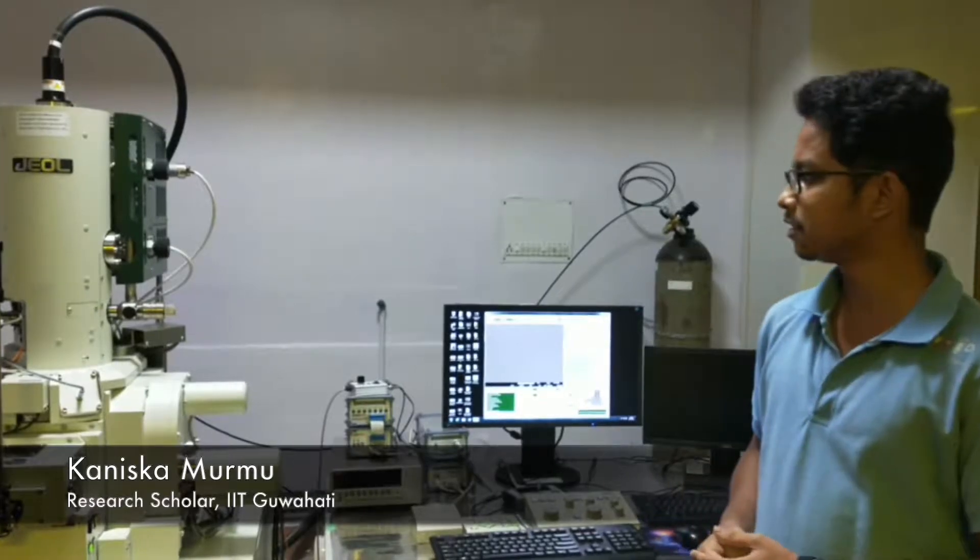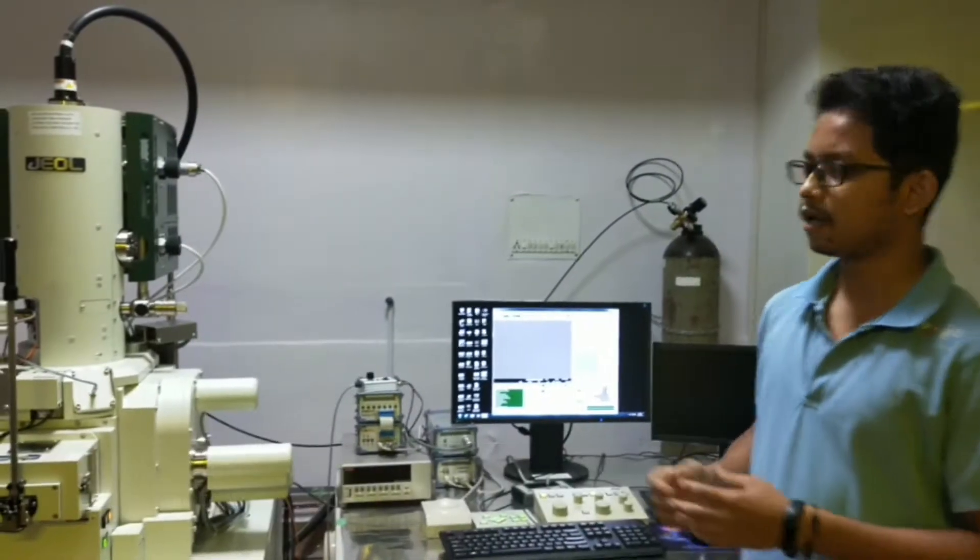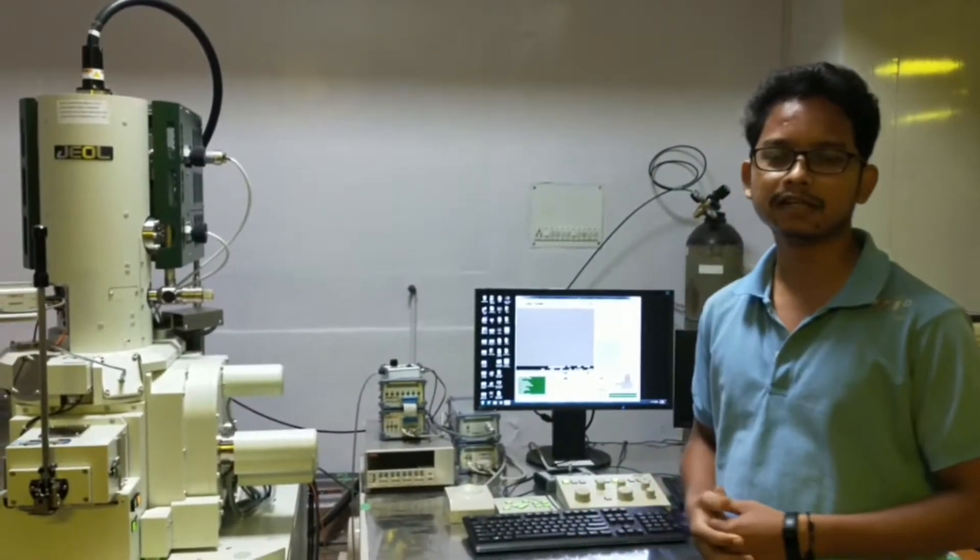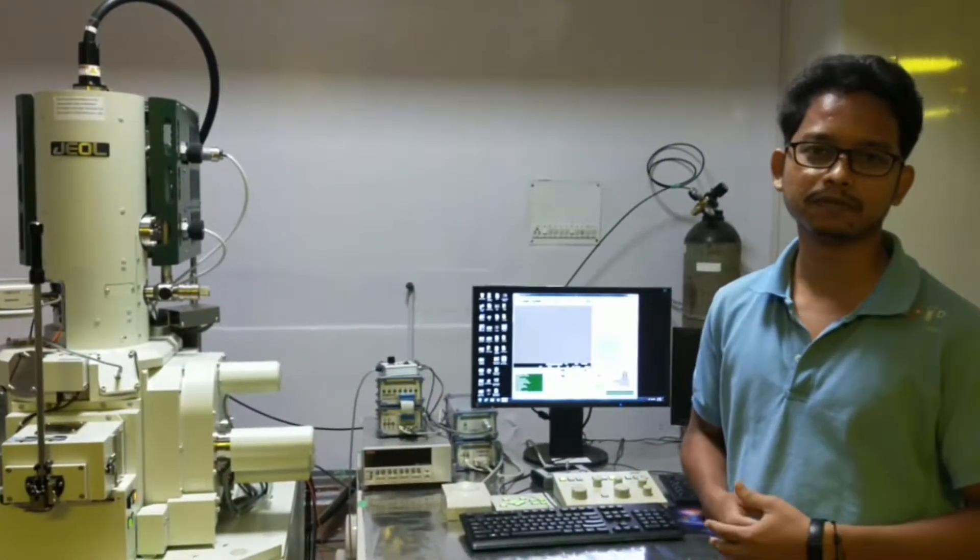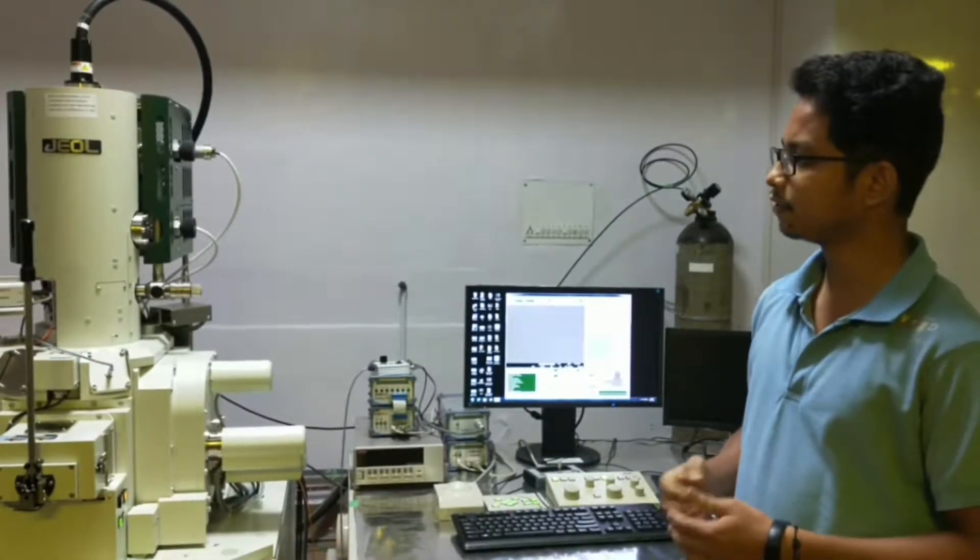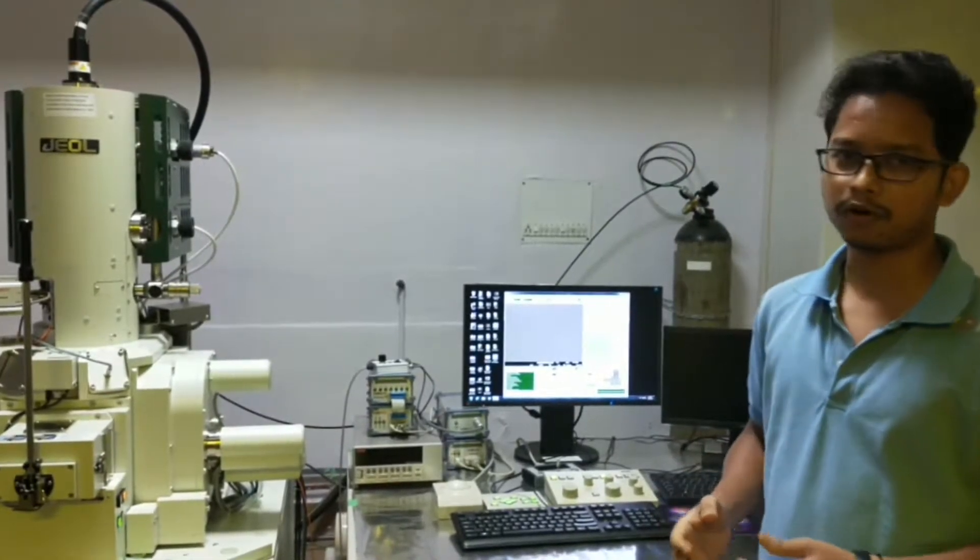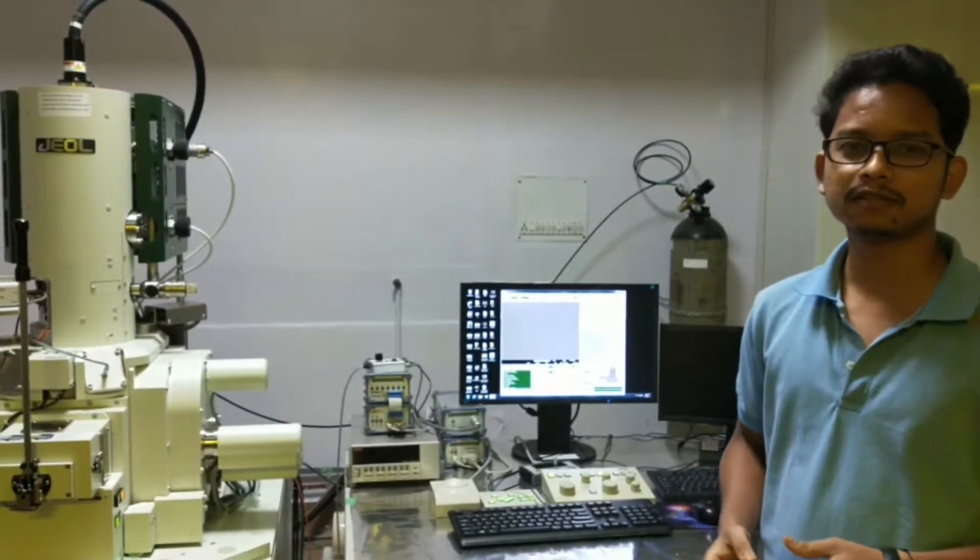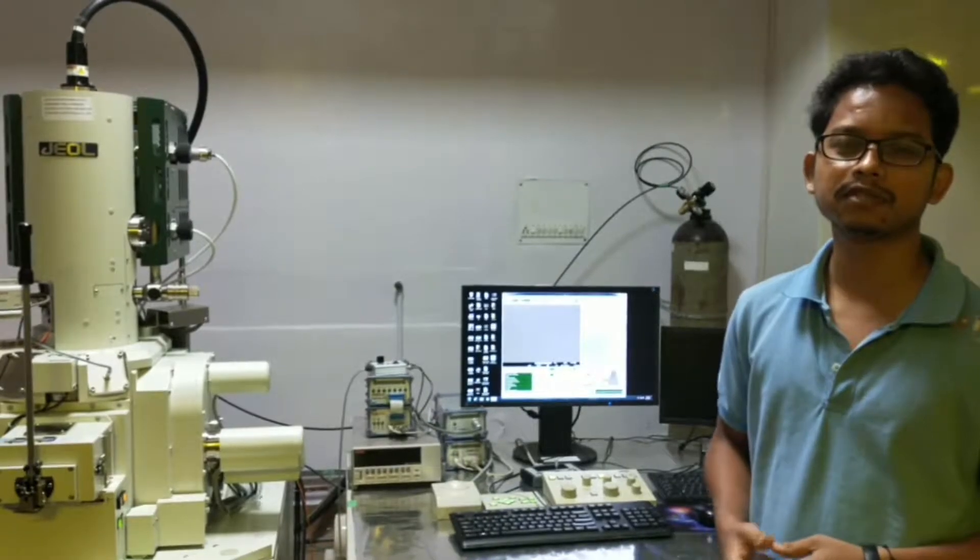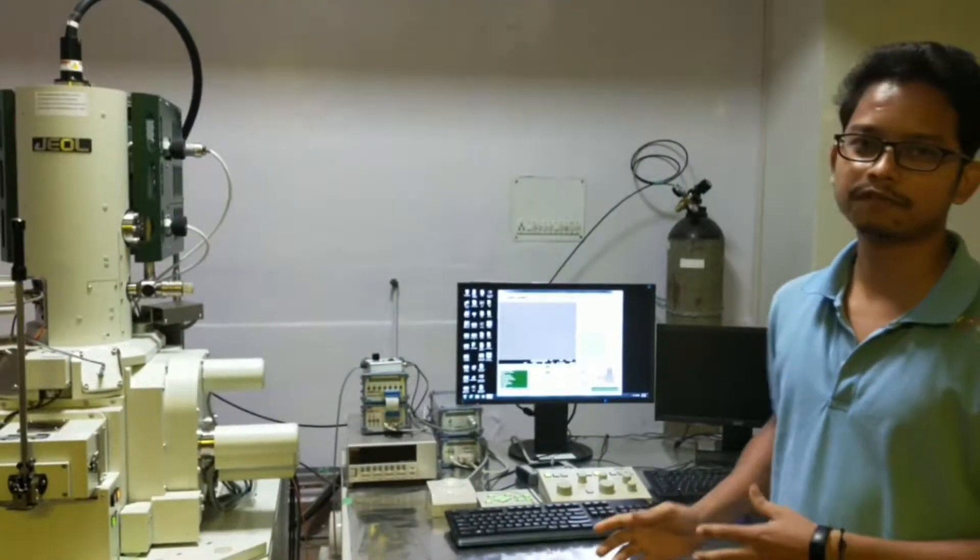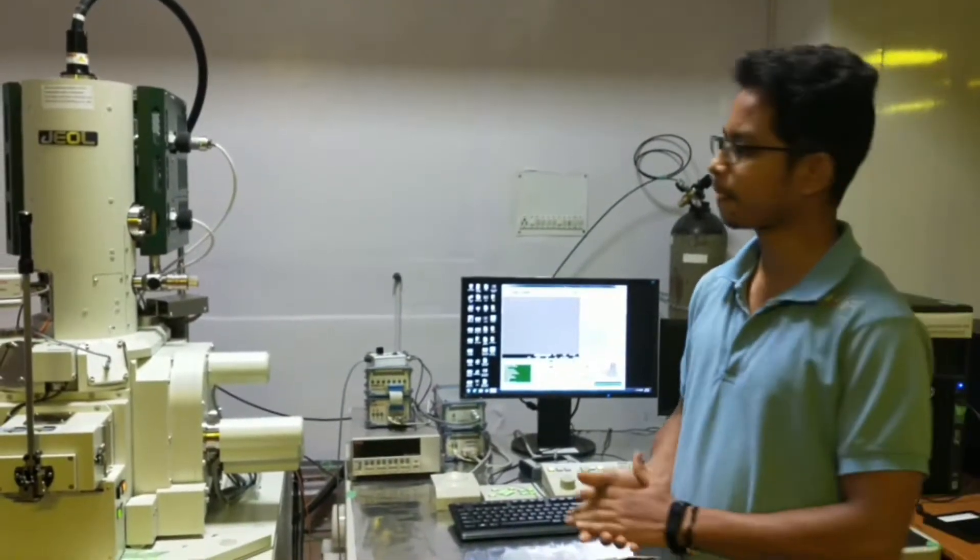Welcome everyone, my name is Punish Kumarmo and I am going to demonstrate FESM, that is Field Emission Scanning Electron Microscope. I am going to demonstrate how it works and how we can characterize our sample through the FESM.